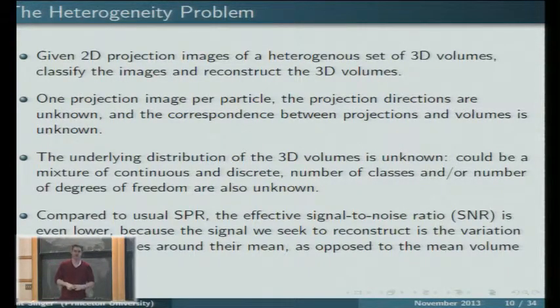So, just like I said before, I think the most famous example is protein channels. They have an open state, and they would close and not let anything go through, and then they would open again. But you don't expect this will happen during your taking one image? So I expect my sample of molecules to have several states, and I don't know the proportion or how many states there are. I know nothing.